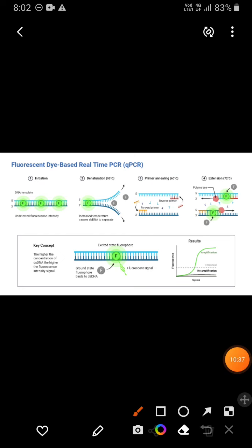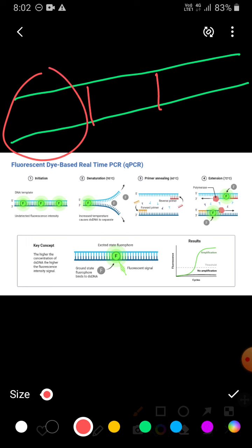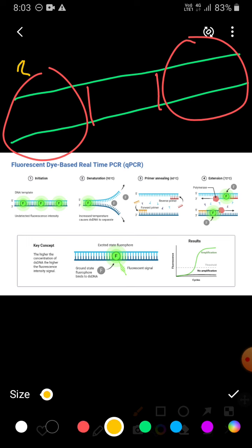as I have told you, during the PCR technique we are not using any kind of restriction endonuclease step, right? So your gene of interest along with other unwanted DNA molecules is also amplifying during PCR. Okay, so if you design the primer in such a way that it binds with the 3' end, so it will bind here.